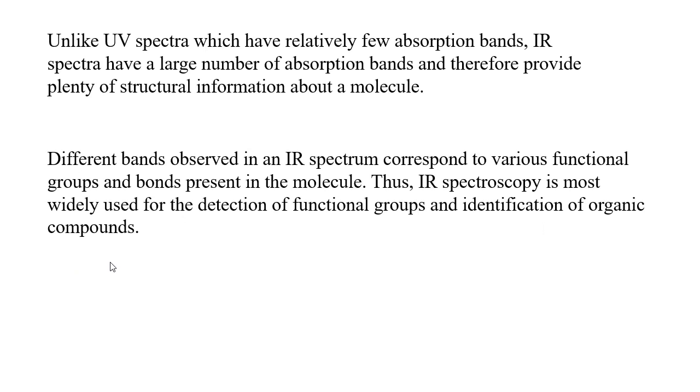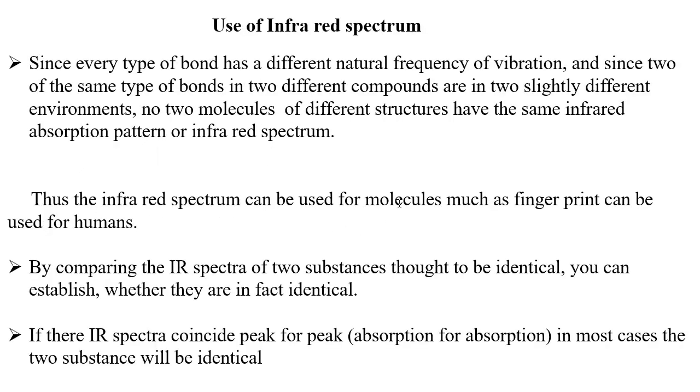Okay, then see how the infrared spectrum is used to get structural information of organic molecules.